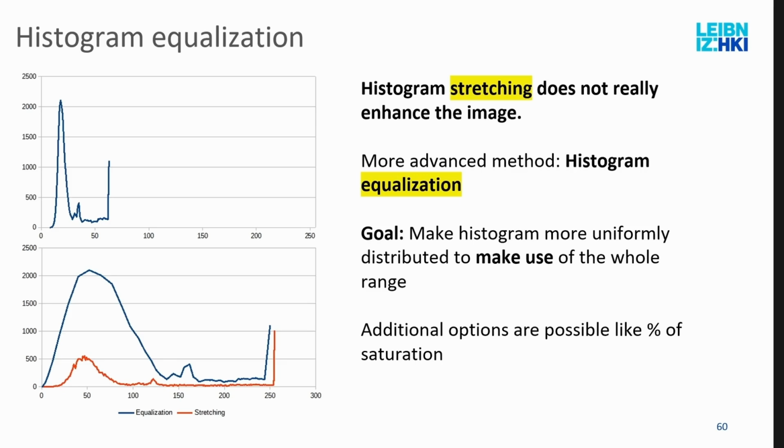As you can see, it's not a line because it assumes that you are working with real value pixel values, which you don't have. You have only 8-bit integral, and then it doesn't work like that. But it can enhance your image a lot if you use it correctly and really bring up structures. There are also in ImageJ especially additional options that you can control some additional parameters of it. You can say I want a specific saturation of the image to be achieved by histogram equalization and more. You can just explore them, try them out, how they behave, and then go with the operation that works best for you. That's anyway the general thing.